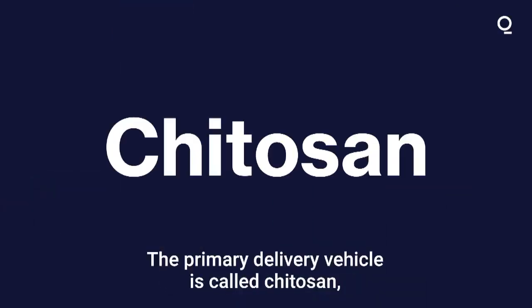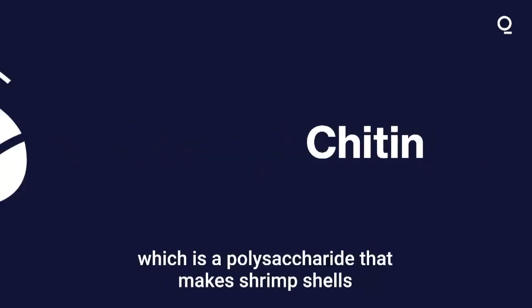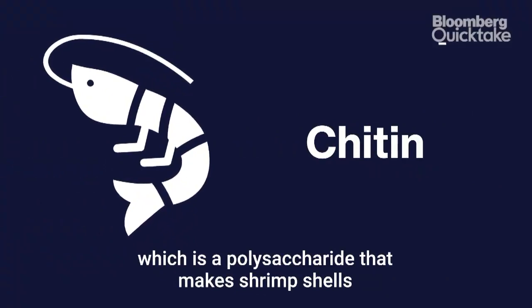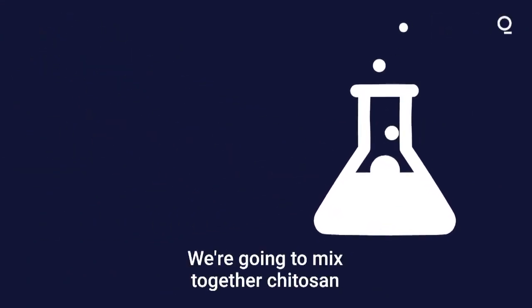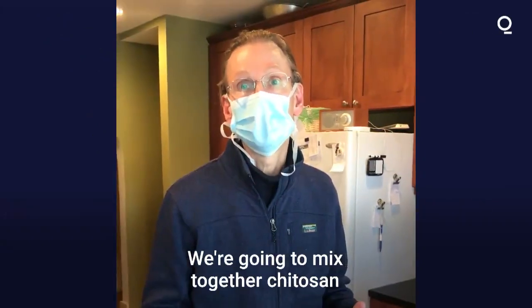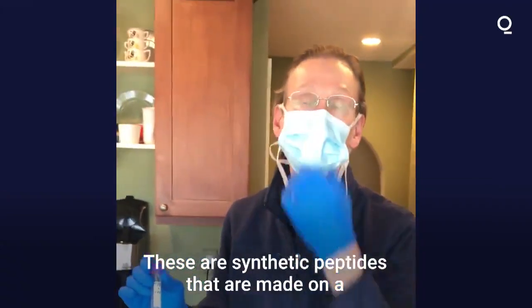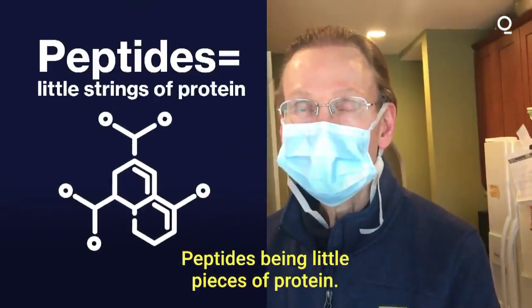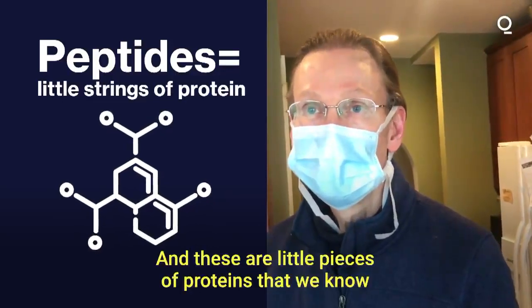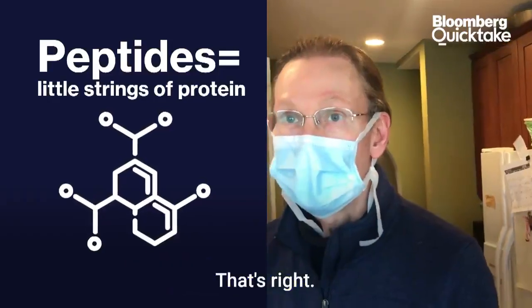The primary delivery vehicle is called chitosan, which is a derivative of chitin, which is a polysaccharide that makes shrimp shells and insect exoskeletons. And then you have to treat it chemically. We're going to mix together chitosan with some other ingredients — these are synthetic peptides made on a peptide synthesis machine. Peptides are little pieces of protein, and these are little pieces of proteins that we know are in the coronavirus or similar to those in the coronavirus.